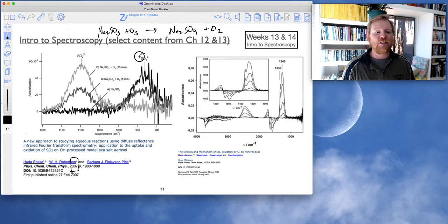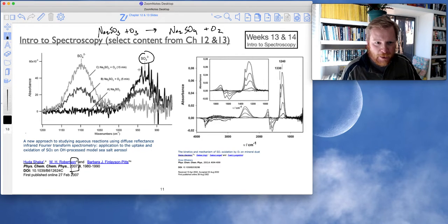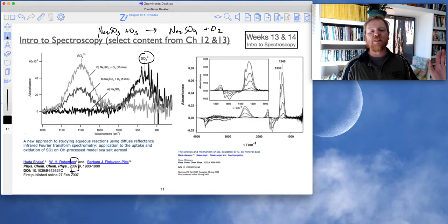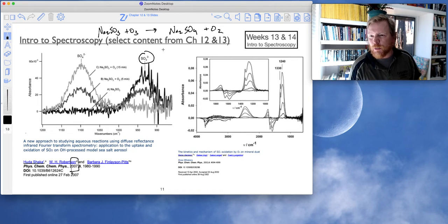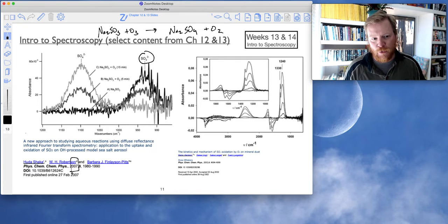And to get this sulfite peak, this also had to be ratioed to a blank sample. So this is like a ratio of a ratio of ratios, okay? Otherwise, if it had only been condition 1, condition 2, this would be a blank line. So you can get a little bit more sophisticated than just 2 conditions. You can add a third condition to get yourself the initial starting peak, right?